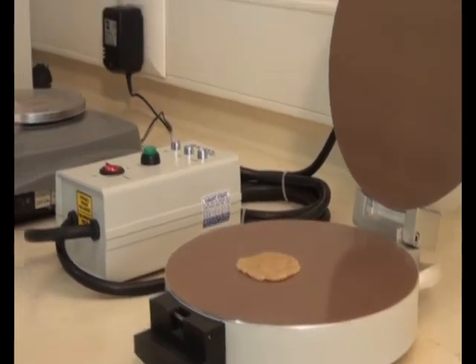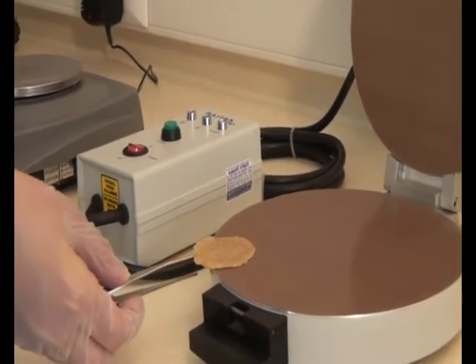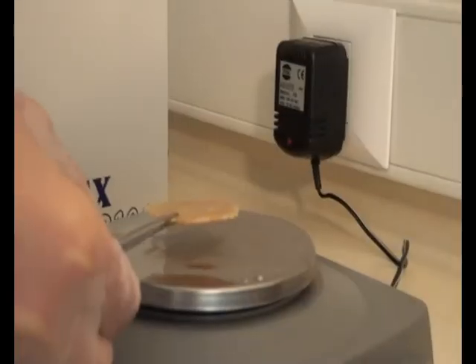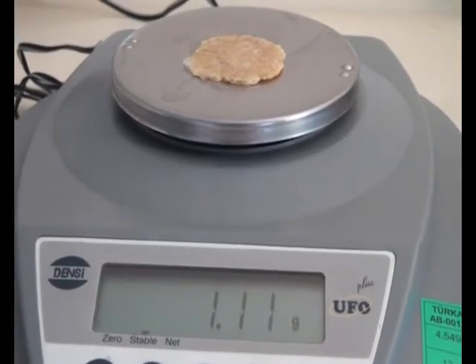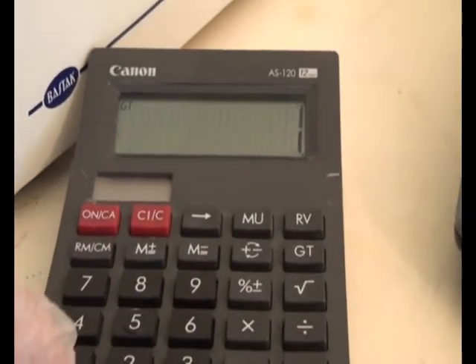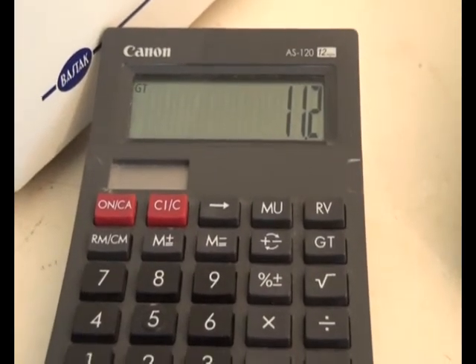When the test finishes, open the cover and take out the dried gluten and weigh it. Multiply the result seen on the sensitive balance by 10 to find the dry gluten percentage. In this example, the result is 11.2 percent.